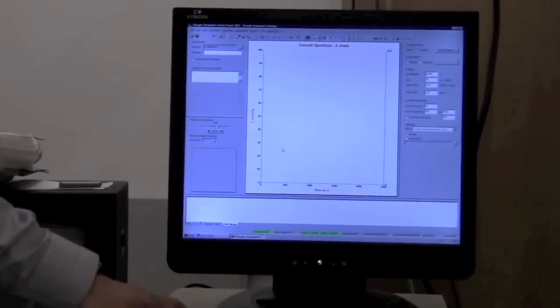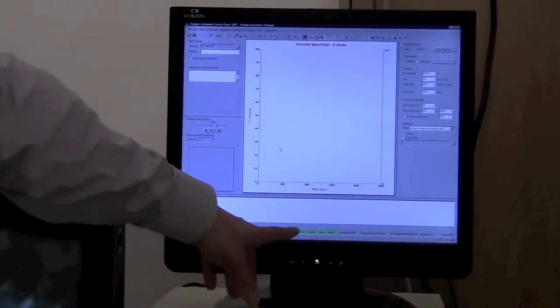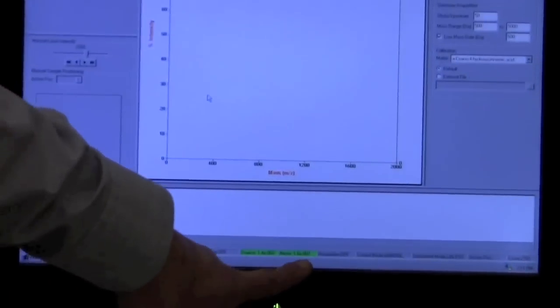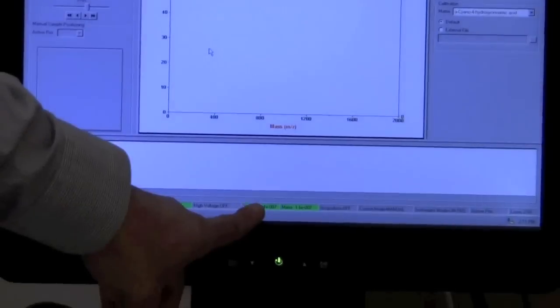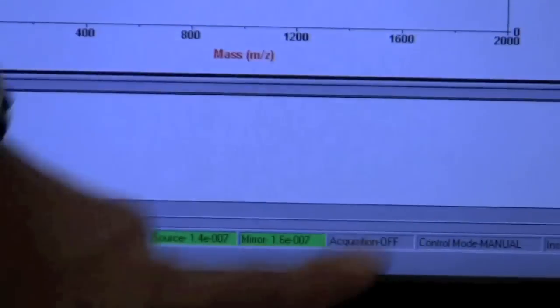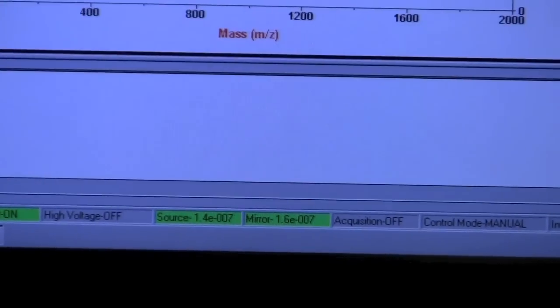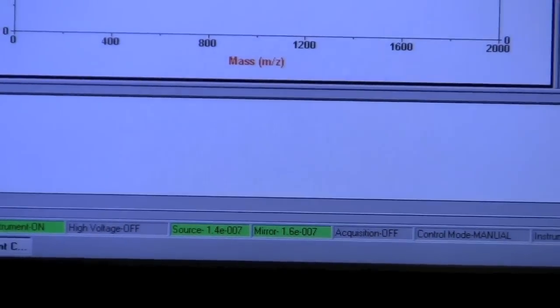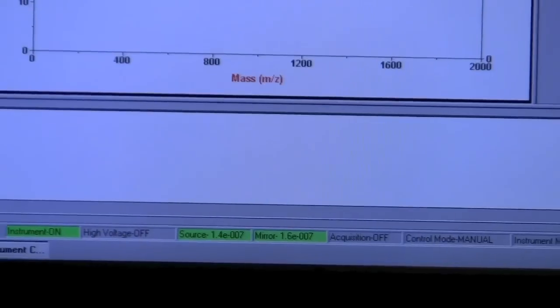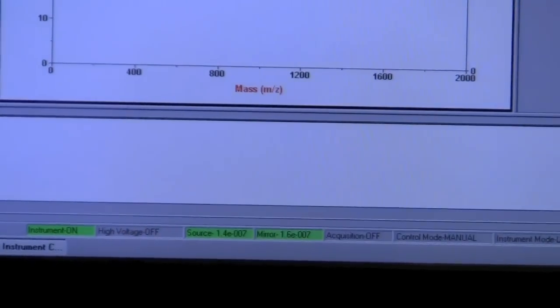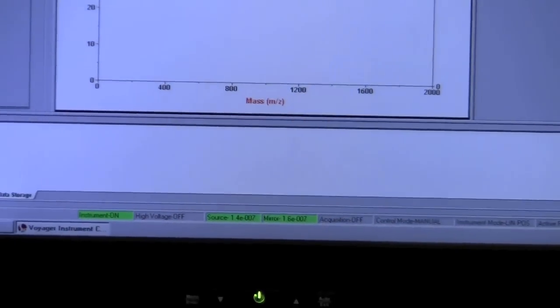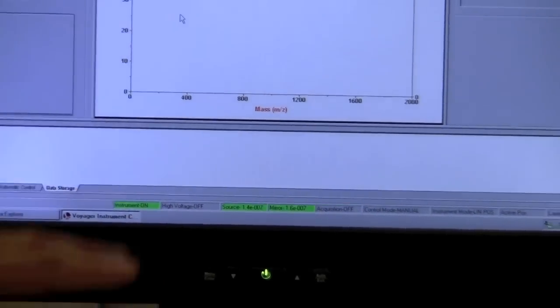The pressure here should be in the green. If it's yellow or red or has an error message here, you may want to contact Instrument Center staff to help you address the problem. In this case, it's ready to go.